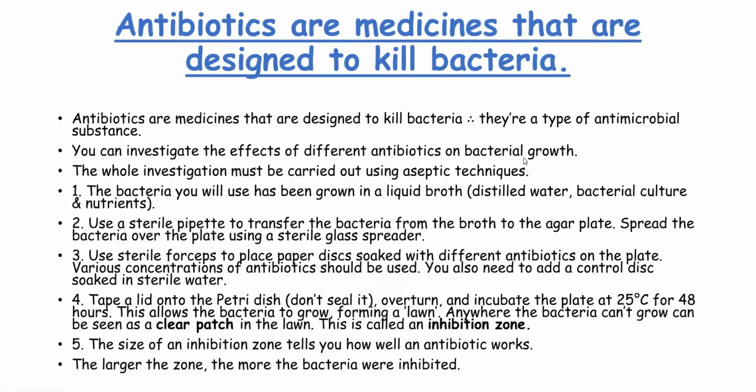So looking at the method, antibiotics are medicines that are designed to kill bacteria, and therefore they're a type of antimicrobial substance. You can investigate the effects of different antibiotics on bacterial growth. The whole investigation must be carried out using aseptic techniques. The bacteria you will use has been grown in a liquid broth, which is distilled water, bacterial culture and nutrients.